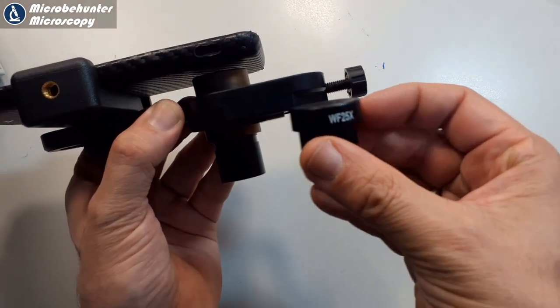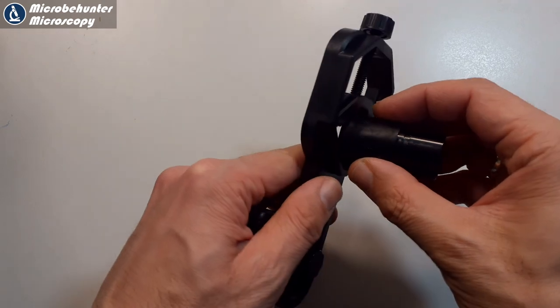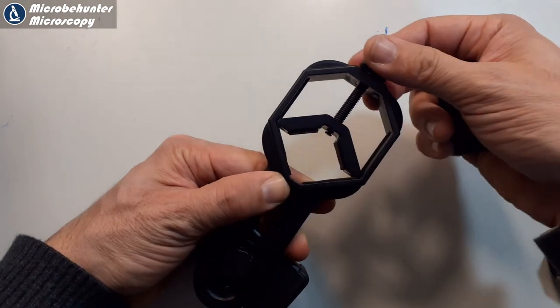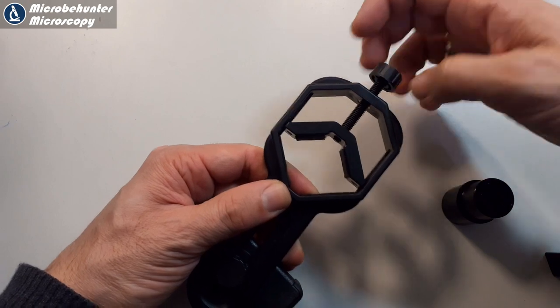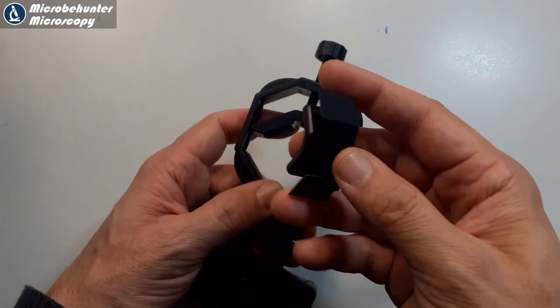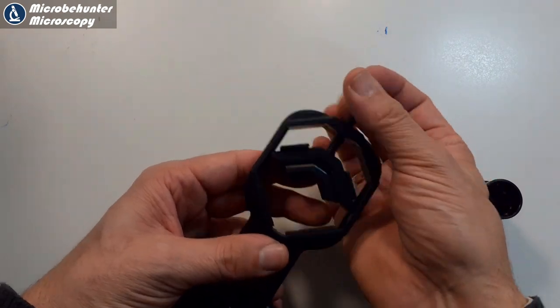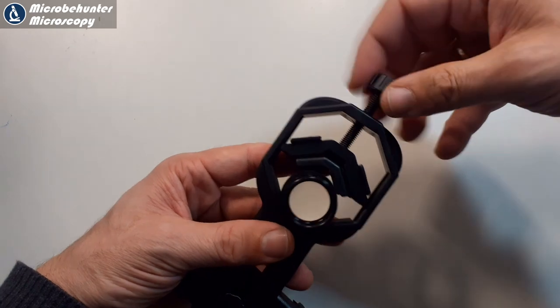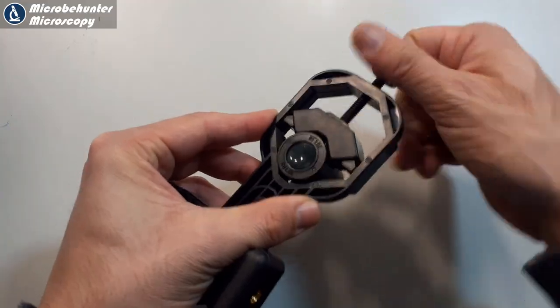Basically what I've got here is a 25x eyepiece and this one unfortunately is too small. This is a smaller eyepiece with a smaller diameter and it was a little bit wiggly when you inserted it, even when you tighten it all the way. For this reason you need to have this small plastic insert that came along with the adapter, and when you put this one in it's able to accept smaller eyepieces as well. So in that sense it's a very versatile system and it seems to work quite well, at least for the eyepieces and mobile phones that I have.